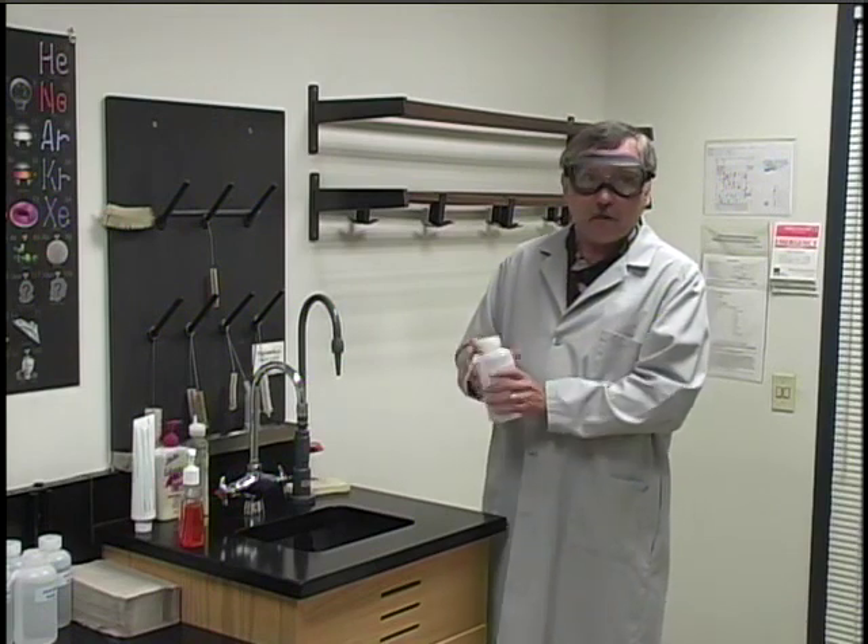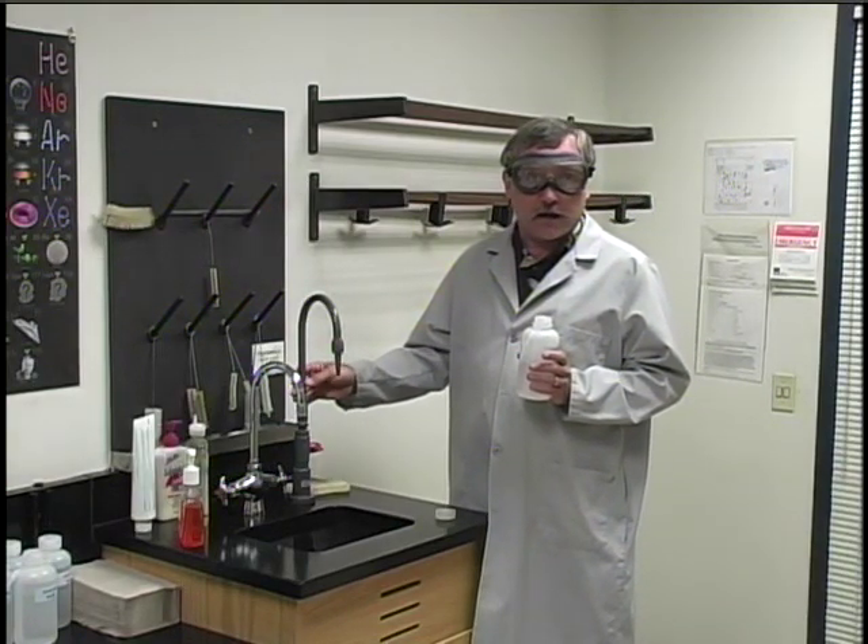When you need to refill these squeeze bottles, or when you need a large quantity of deionized water, you need to come over to a special tap in the room. There's only one tap that dispenses deionized water, and it's this gray plastic tap. You should note where that is in your particular lab.